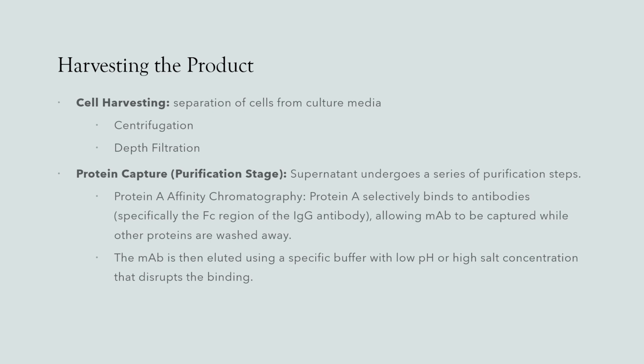And then this is the crude, if you like, and you put it through depth filtration, which can further remove larger host cell proteins and host cell materials, or any other material that shouldn't be there. And then you go through these purification stages. The first step that I've got here is protein capture. You may very well do some more things before you go on to your chromatographic steps, but this is just what I've got to summarize.